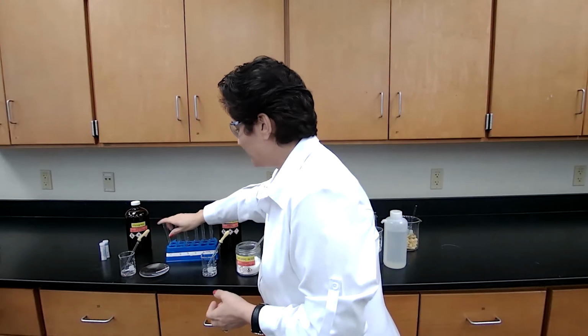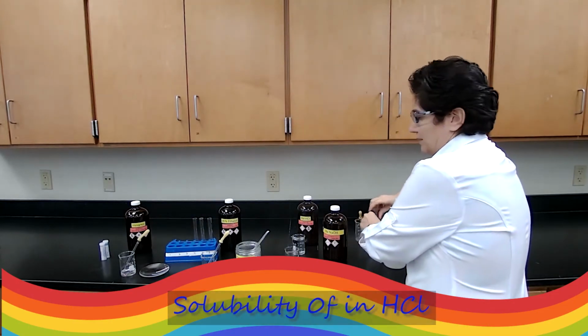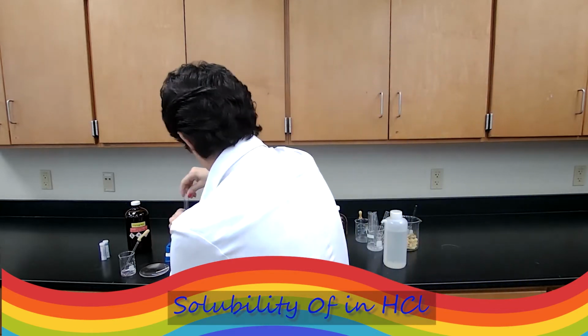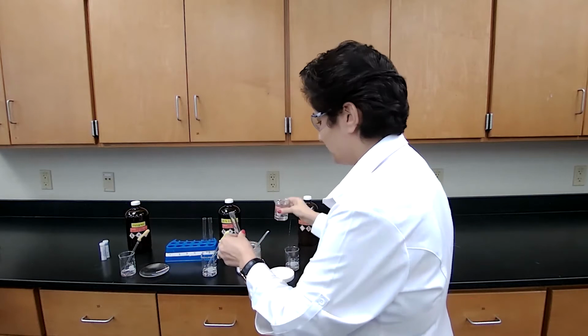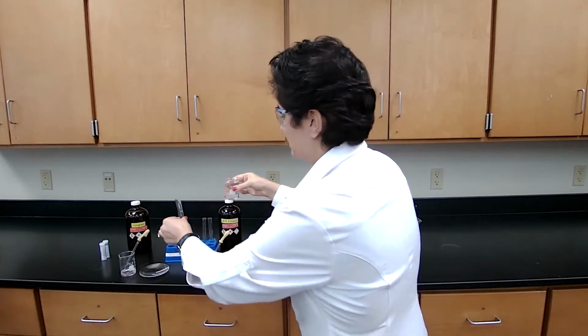The next solvent that we are testing is HCl. With the HCl, I will add the HCl to the 3 test tubes. Same procedure as before.